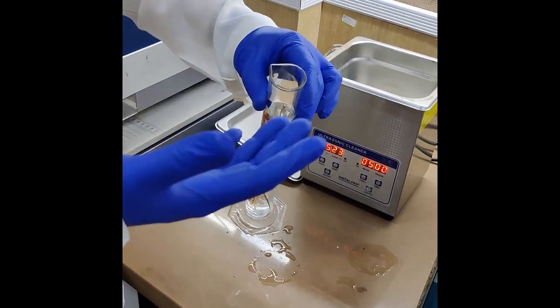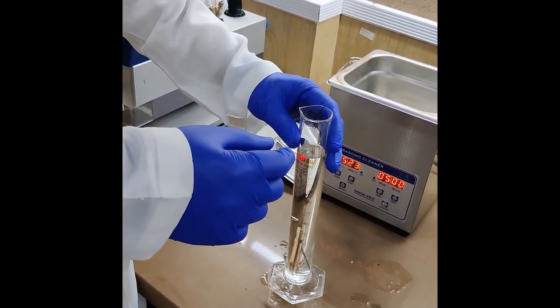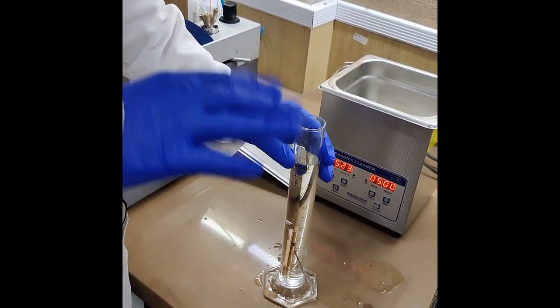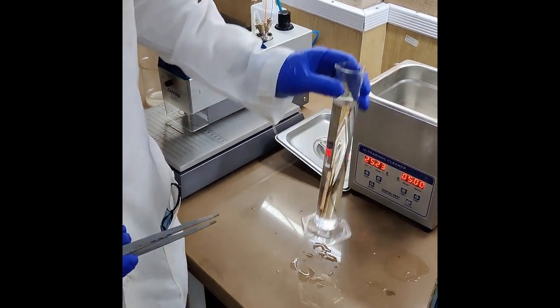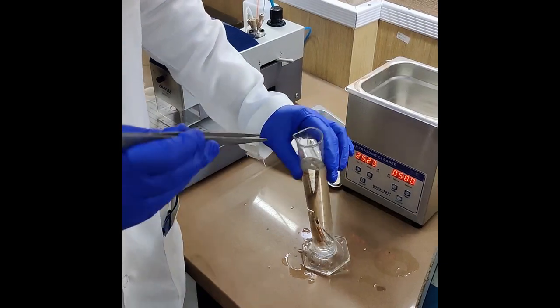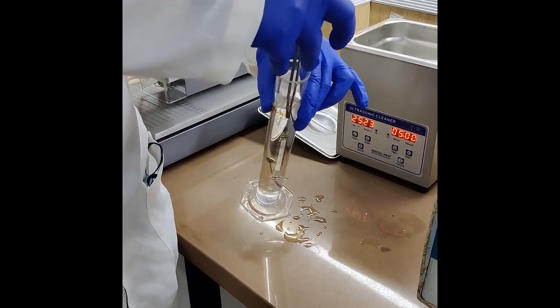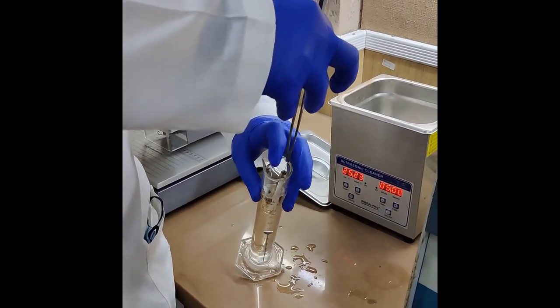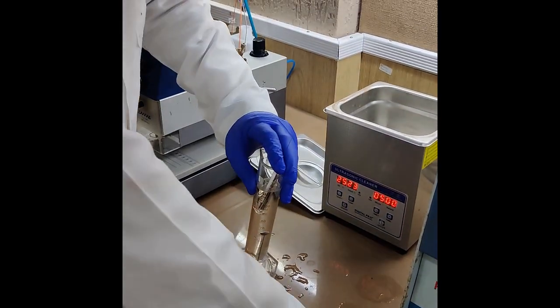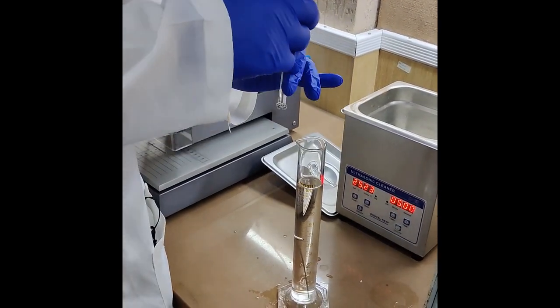You can do it with your hands or use a forcep. I have removed it from the sonicator with the help of forceps by slowly picking it up from the measuring cylinder and taking it outside. The same is repeated for the piston as well.